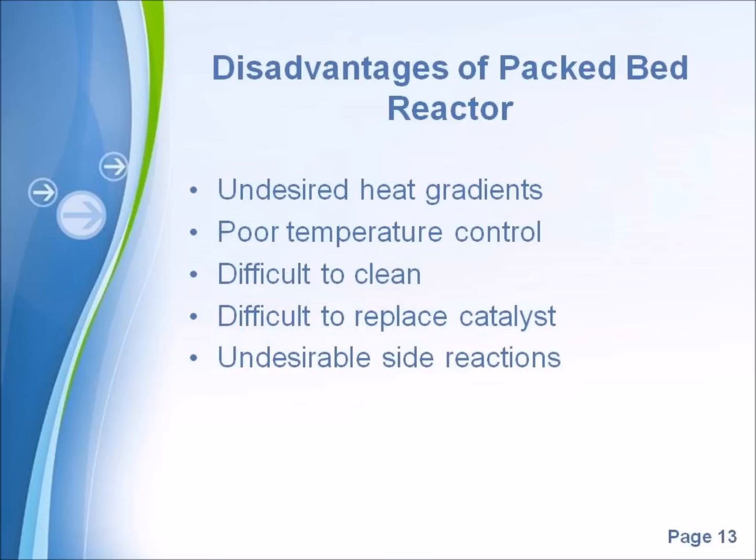Disadvantages of packed bed bioreactor: undesired heat gradients. Poor temperature control. Difficult to clean. Difficult to replace catalyst. Undesirable side reactions.